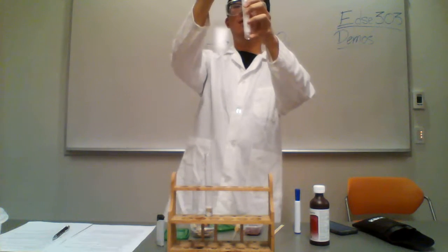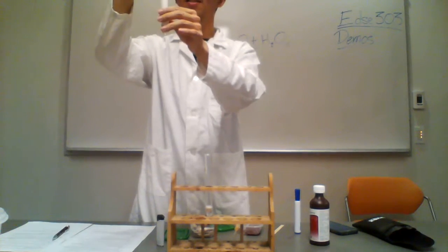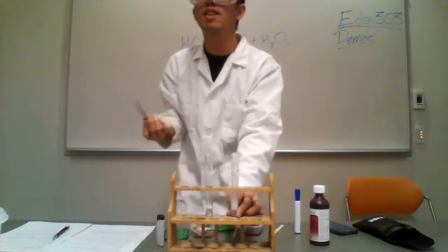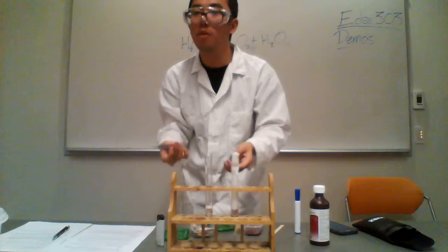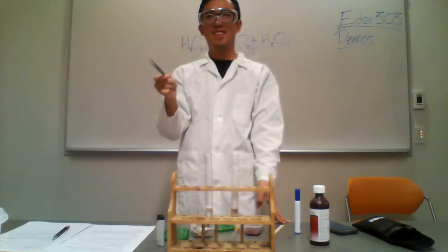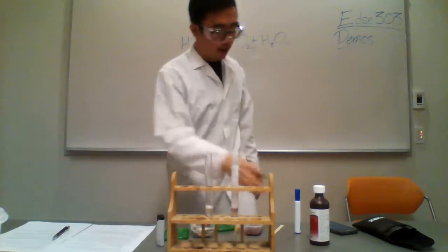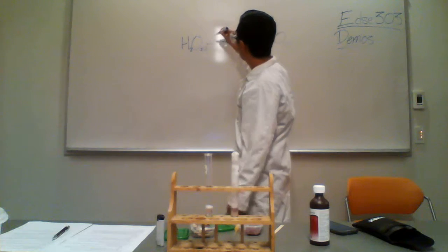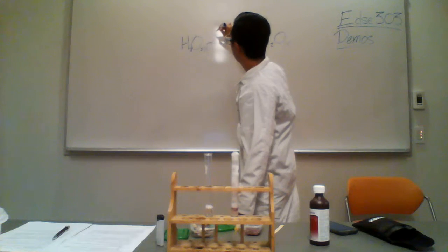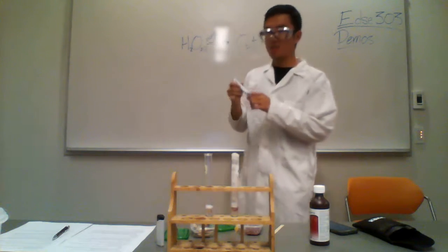I'll let this settle first, then pass it around. If you feel this, it's actually a little bit hot now. So what kind of reaction would that be, in terms of chemistry? Exactly, it is an exothermic reaction. So basically it's releasing heat, so we can add onto this that it's releasing heat energy. I'm not a chemist. Your chem teachers can teach more.